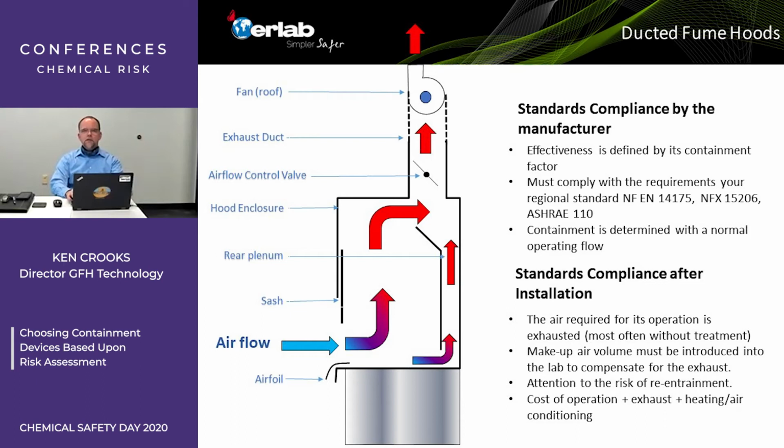And then always, if you are exhausting that fan on the roof, pay attention to possible re-entrainment. That exhaust air could somehow mix and come back into the building, either through open windows, HVAC inlet systems, or even a downstream building just across campus. That concentration will be diluted and hopefully enough for no hazard, but it can progress across the campus and possibly be re-entrained in your building or someone else's building.